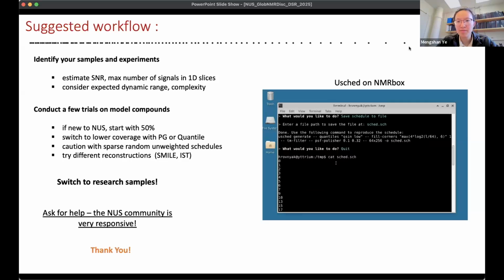Sounds great. I might take advantage of this to just comment on a couple of things that are tangentially related. That there are interesting ideas that have been explored out there. For example, when I first saw the word oversample, I thought something else. You can also oversample in terms of sampling from a finer Nyquist grid so that your effective spectral width is larger. You can push sampling artifacts further outside of your intended spectral window that way. And that's been considered. It hasn't taken off yet, but that's been considered and worth looking at.